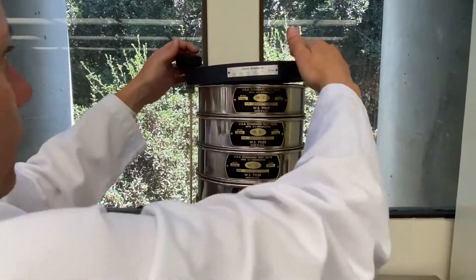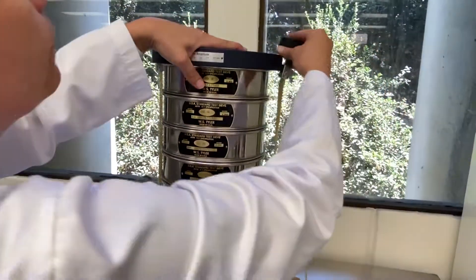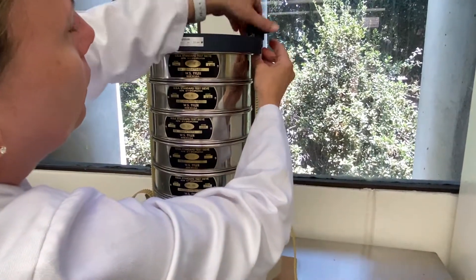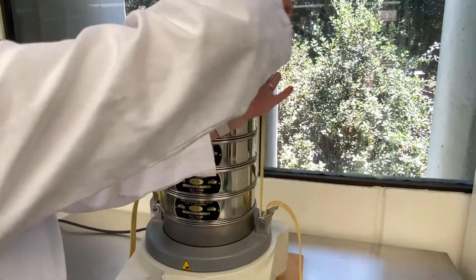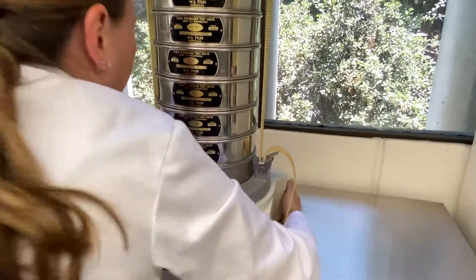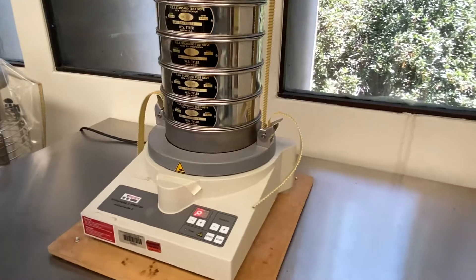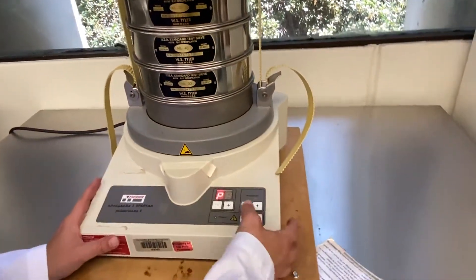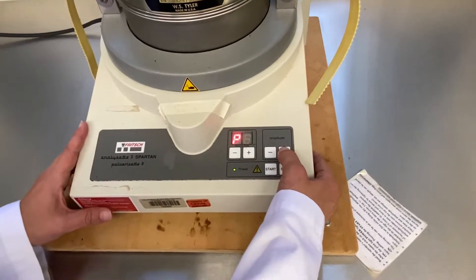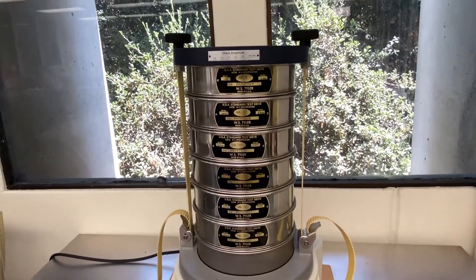After you load the coffee into the sieve shaker, you reseal it. Make sure that everything is nice and tight. You turn it on, hit the start button, and you start to increase the amplitude — and it's going to get louder as you keep pushing the button.